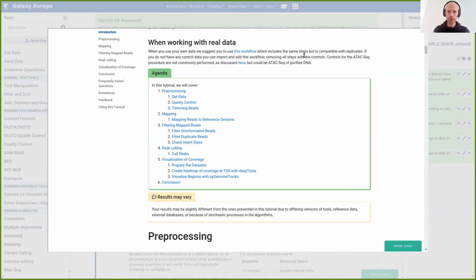So we will use FastQC again, if you already know it. I will repeat some of the plots, however, I will not go that much into detail. I will go into detail for those plots which are important for ATAC-Seq. However, if you want to know more, then please go to the quality control training and to the Galaxy introduction to fully understand this training material.